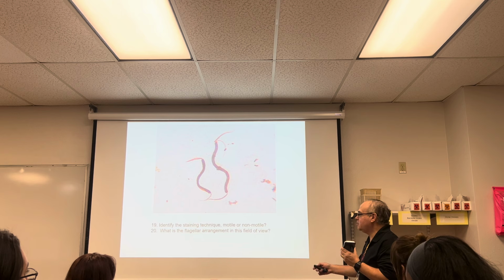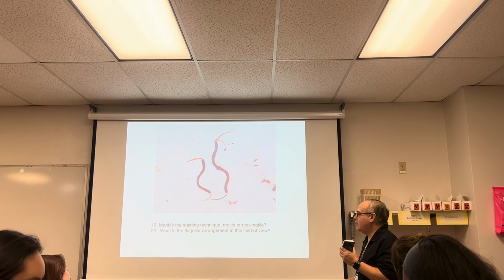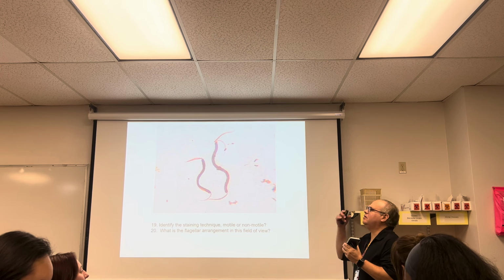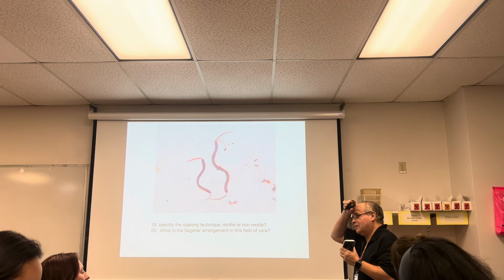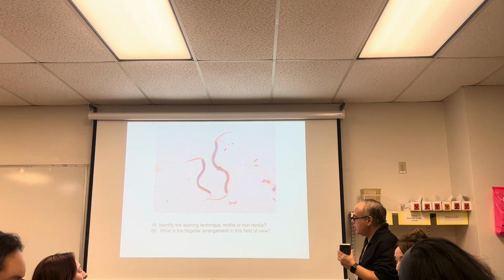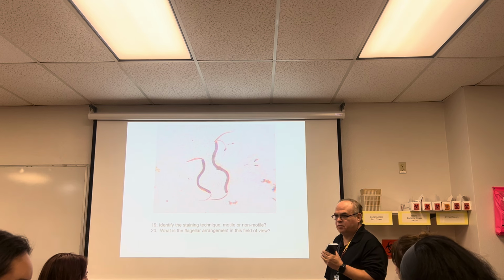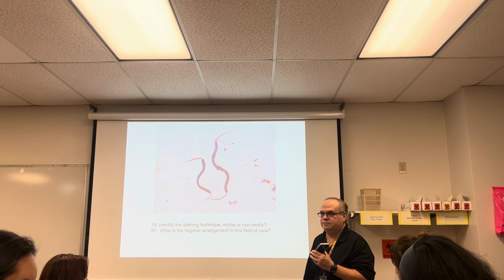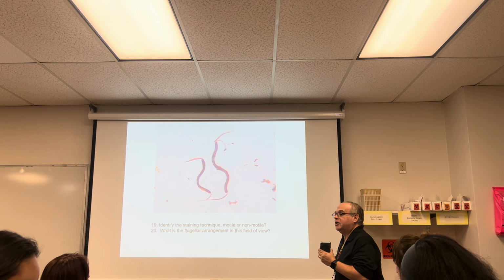So what's the special staining technique? It's a flagellar stain. So is it motile or non-motile? By definition, all spirilla or spirochetes are motile. By definition. So this is the hard one.